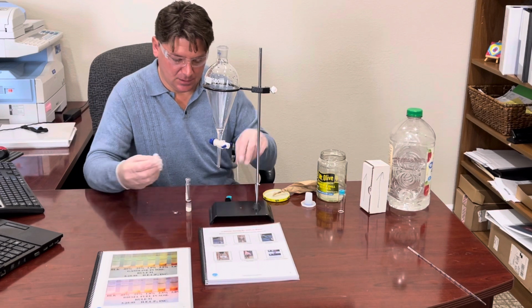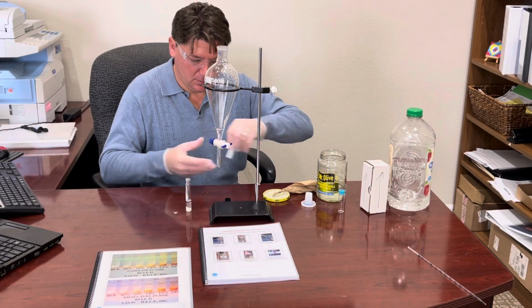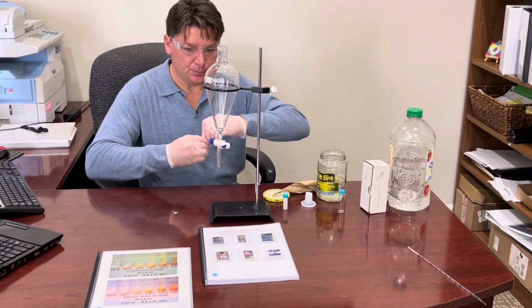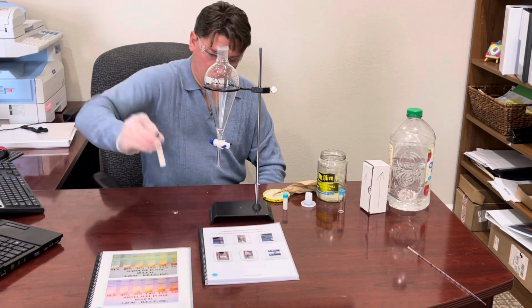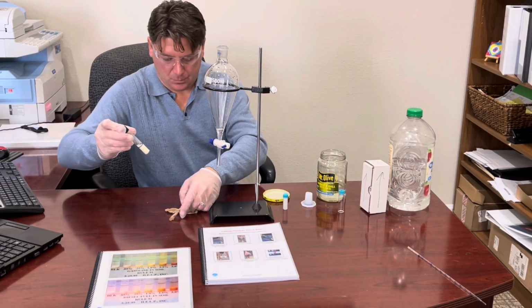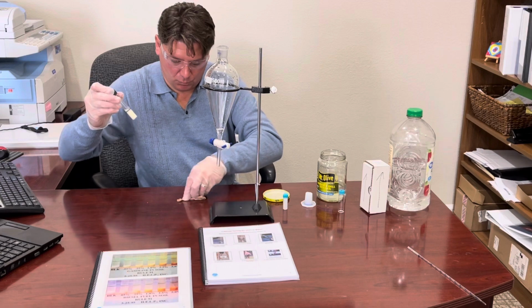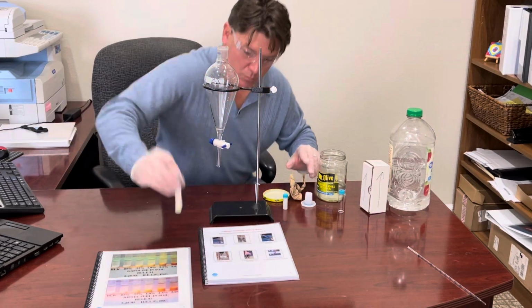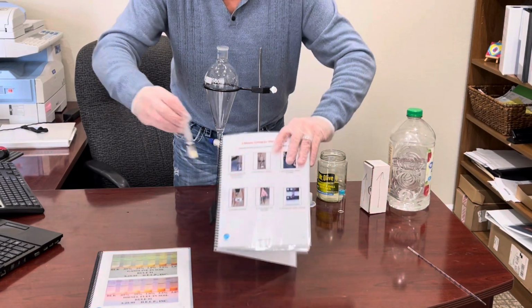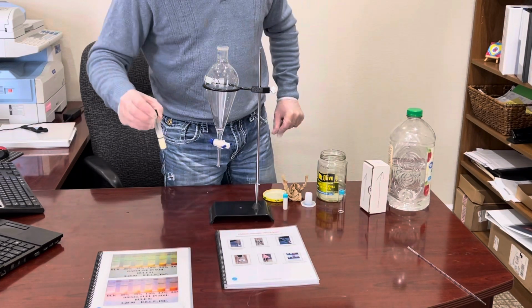Okay, as you can see, that solvent is no longer white. As you can see, it's no longer white. Obviously, we can just put it right up to the book right there and see that the book is white, and this against the white background is no longer white.